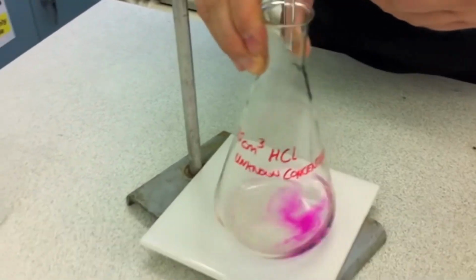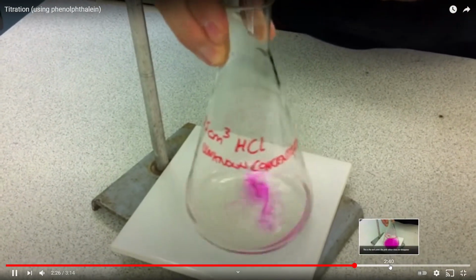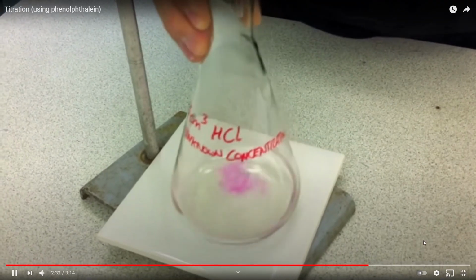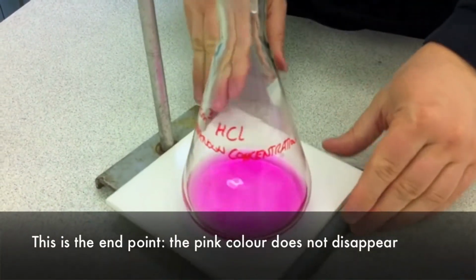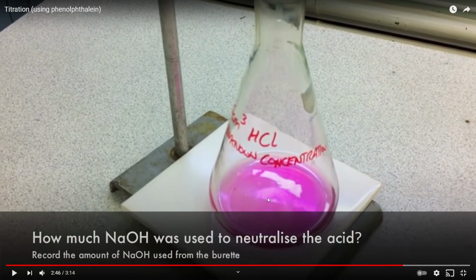So you're trying to make it get into that range. And it's at this point where you're like, yes, I've got it correct. And then your professor walks up to it and tilts the thing sideways and swishes it and it turns all clear again. And you don't know if you're below the limit or above the limit.